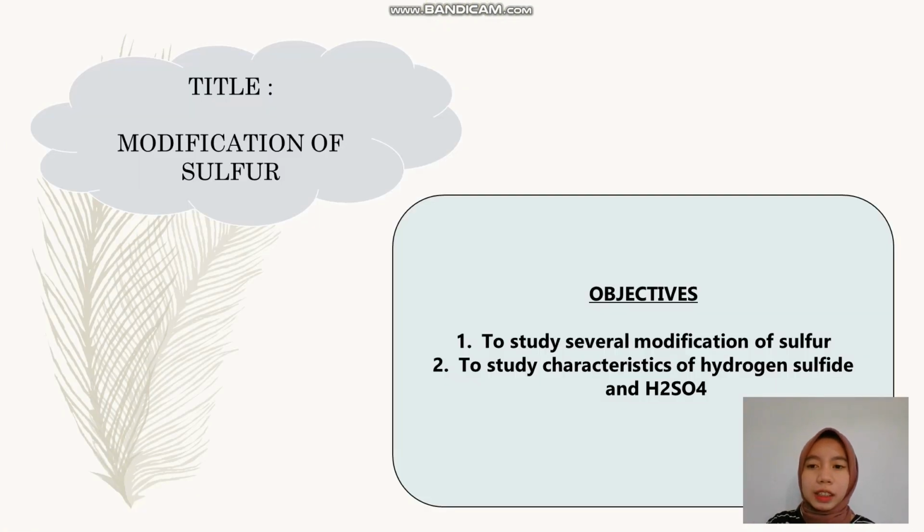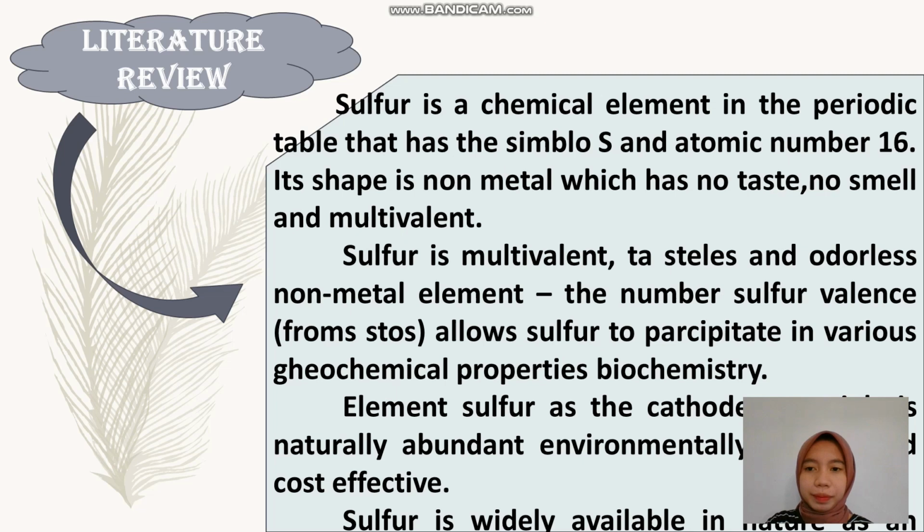The title: modification of sulfur. Objective: to study several modifications of sulfur, and to study the characteristics of hydrogen sulfide and H2SO4.